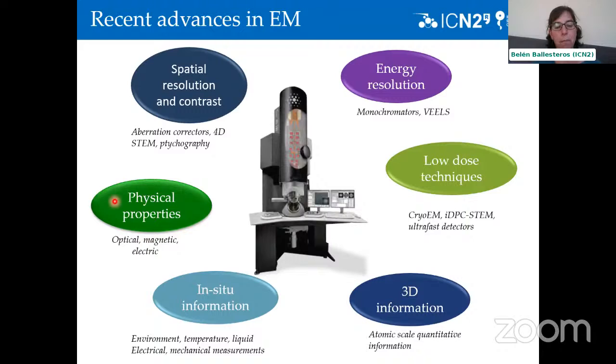Not only can you do it statically, but also in situ. So you can change the environment, the temperature, and even work in liquids, and study your sample in conditions which are closer to real conditions. And this, for instance, is very interesting in catalysis, among others.